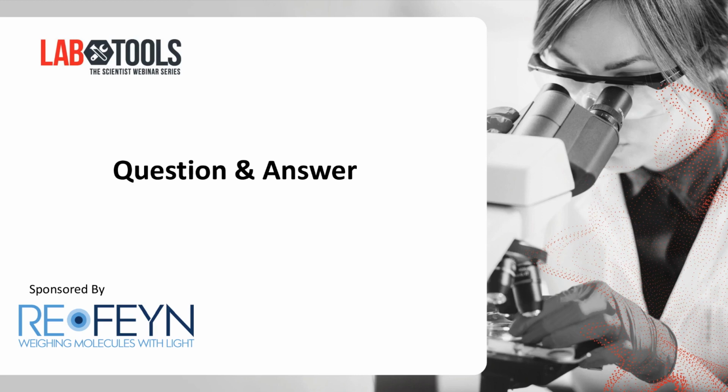But because these techniques are still quite young, there's still a lot of work to be done in terms of pushing the upper limit. But as a rough guide, I would say it works really, really well between 50 kilodaltons and say 1 megadalton.